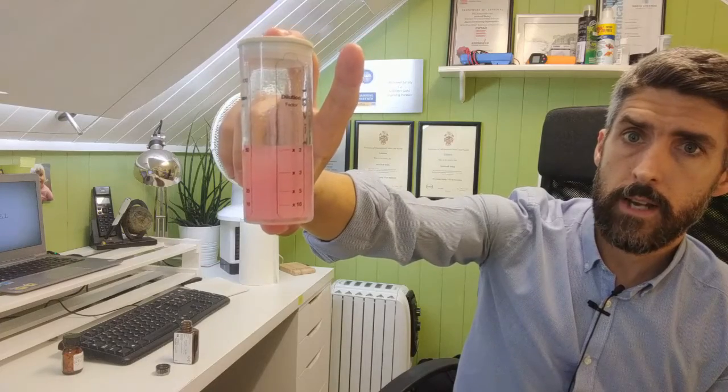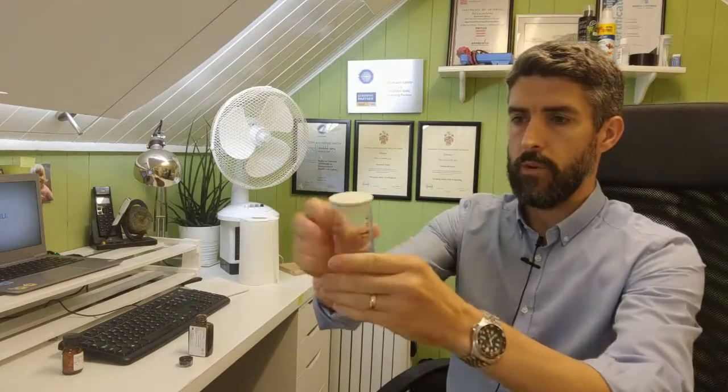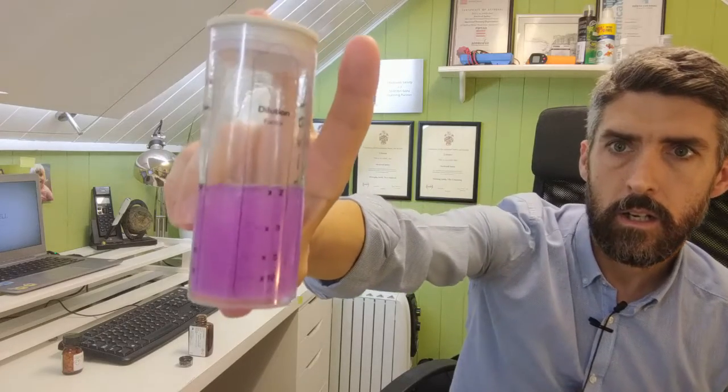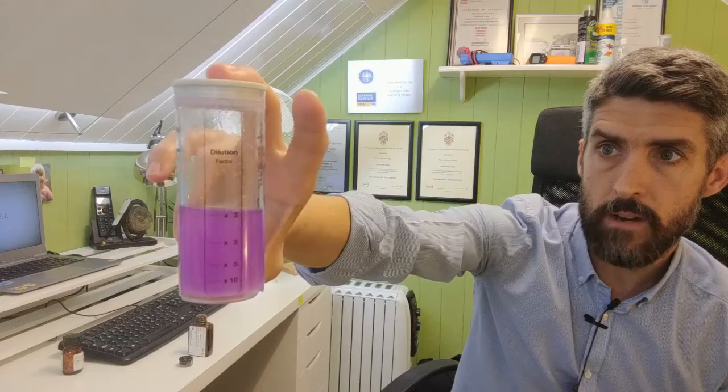And it's still staying pink. So tablet number 4. Obviously you could use a 100 ml sample, but you'd have to use twice as many tablets and the test will take twice as long. This is tablet number 4 going in, and I think this will be the one that brings about the colour change. Yeah, there we go. There's a definite change of colour from a pink coloration to that violet colour, and that took four tablets. It would have taken 8 if we'd used a 100 ml sample.